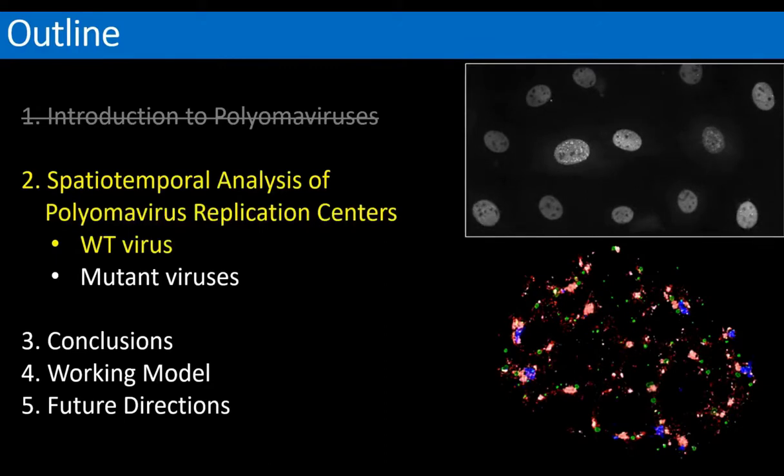So that wraps up the introduction portion of the talk, and now I'm going to tell you what we've learned about murine polyomavirus replication centers using live cell and super resolution microscopy techniques.